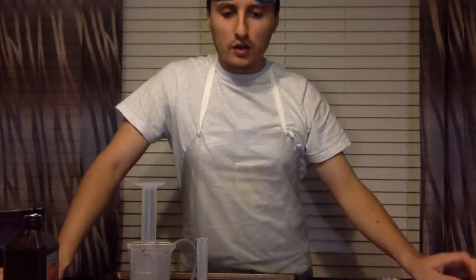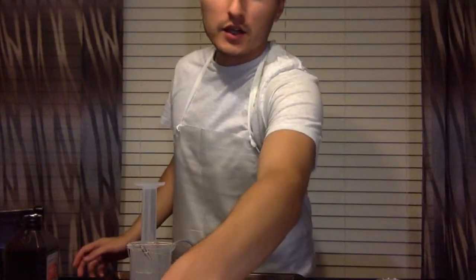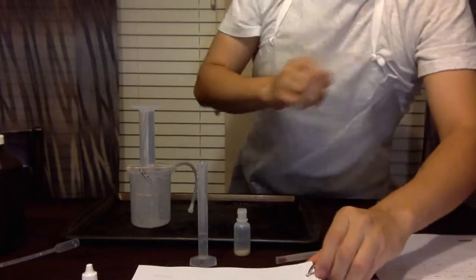Hello, everyone. We are here doing our final lab, which is determination of the ideal gas law constant. For this lab, we will be using our hydrogen peroxide, which I have here already. I'm going to face the camera downward so you guys can see.